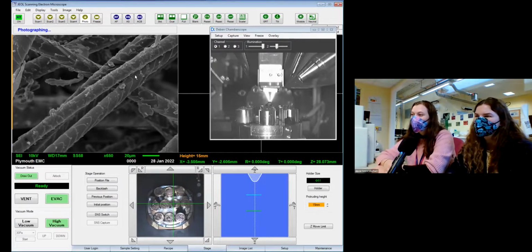So quite similar to Laszlo's, which I guess makes sense because they're both working dogs. Yeah. And it's that outer sort of stuff that keeps them waterproof rather than keeping them warm.